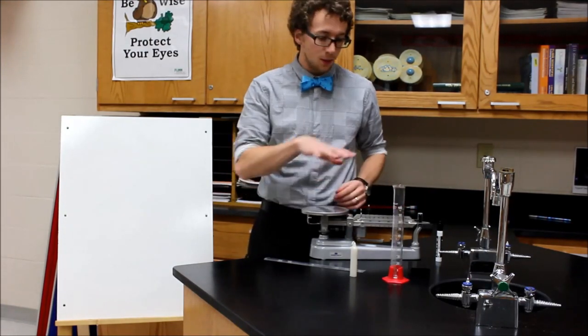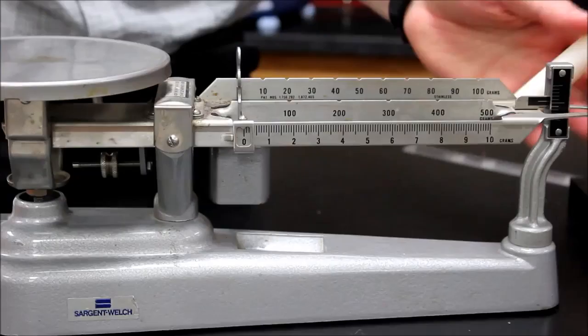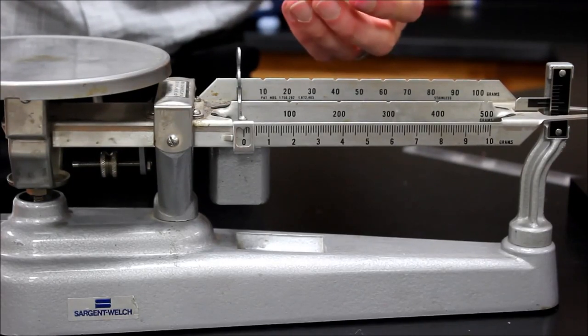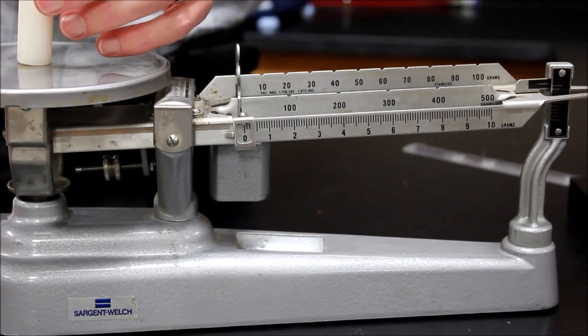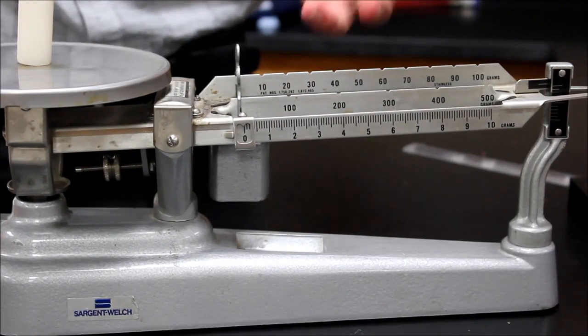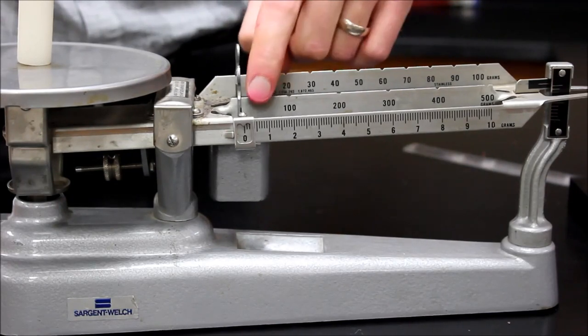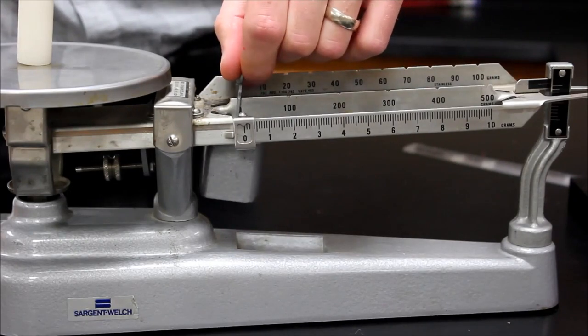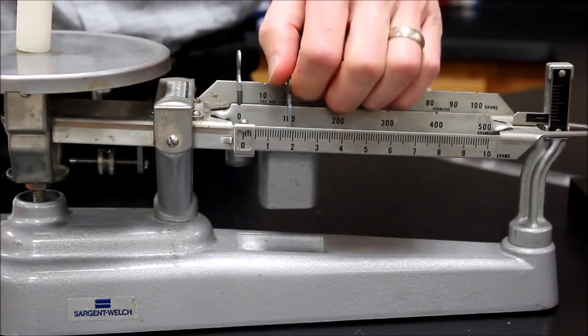So to start off with we're going to do the triple beam balance. Now the first thing I want to do is place the object that I want to weigh in the center of the pan on the triple beam balance. To start off with I'm going to move the largest weight first. That's this beam right here because it goes by 100 at a time. So I move it to the next notch and that's obviously way too much so I need to move it back.